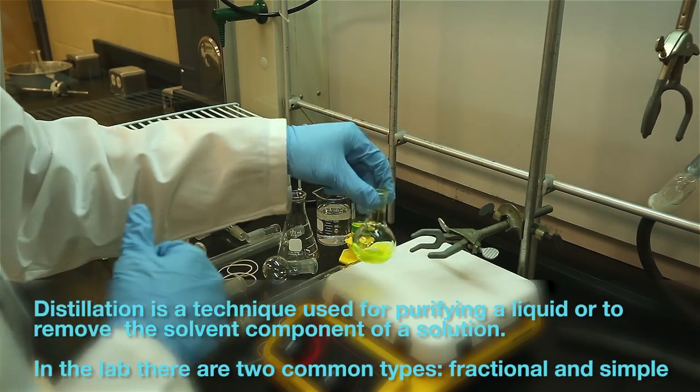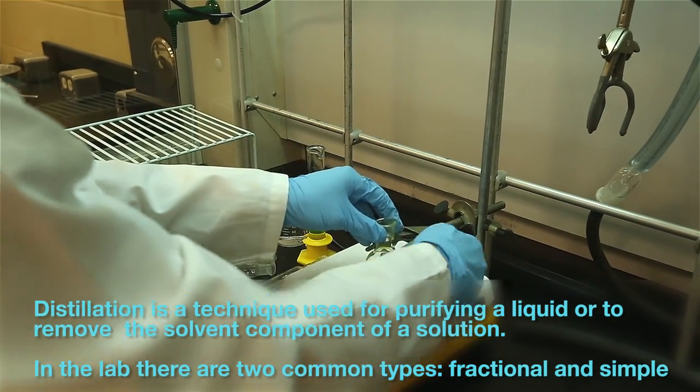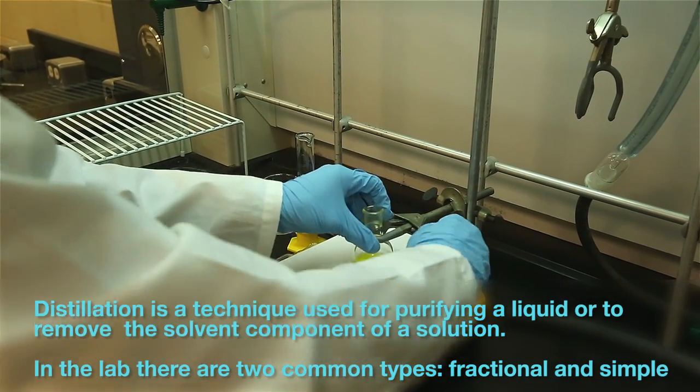Distillation is a method commonly used to purify a liquid by utilizing boiling points or to remove a solvent in a solution.